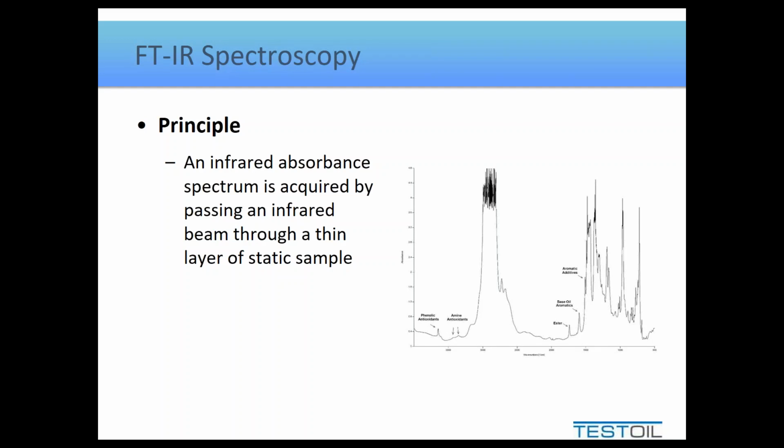As you start to see a used sample, some of those peaks will shrink, and therefore we'll know that some of those additives may be depleting or degrading. But then we'll get some additional peaks appearing, which indicates contamination or mixtures of different fluids perhaps. And by measuring all these different wavelengths, we can identify how much of what is in the oil and report it back to you.